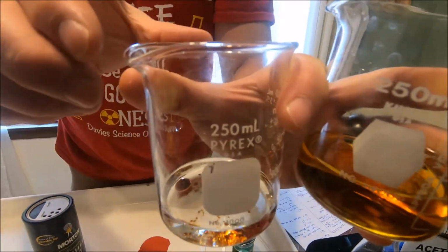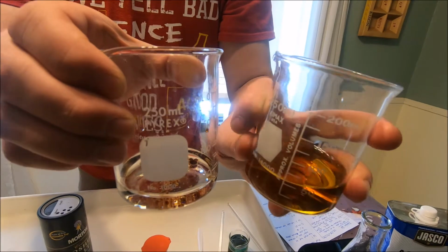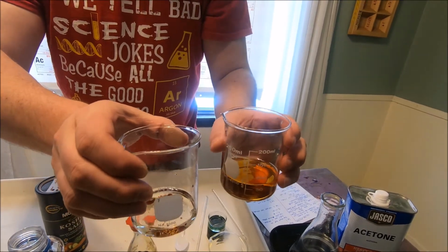So when we talk about that "like dissolves like" idea again, the polarity of the soy sauce is similar to the polarity of the water, causing it to dissolve. The polarity of the oil is different from the polarity of the soy sauce, so it does not dissolve in it.